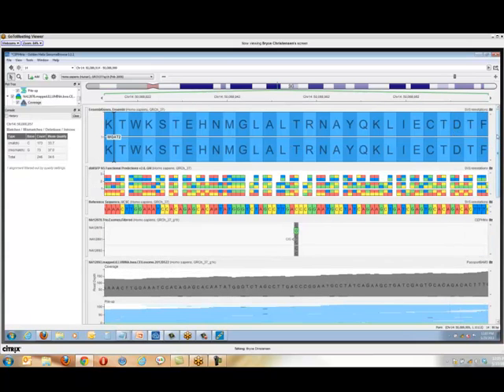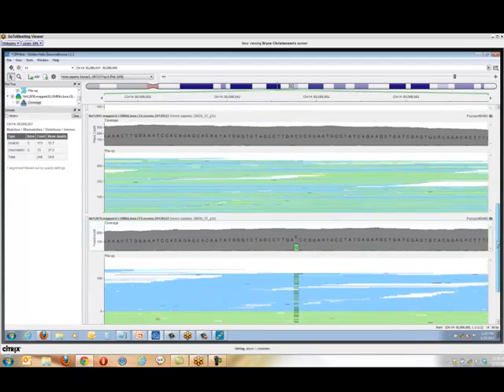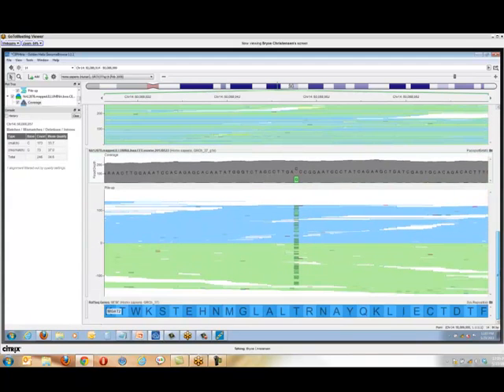And this happens to be a non-synonymous variant that turns out isn't a particularly interesting one, but it's still a non-synonymous variant. The fact that it's not a perfect 50-50 proportion might indicate this is a somatic change that isn't in all of the tissues for this offspring. It's hard to know for sure without doing some more study there. So those are some good examples, and there's actually one more I want to show. And then we'll talk about some of the things that can go wrong.